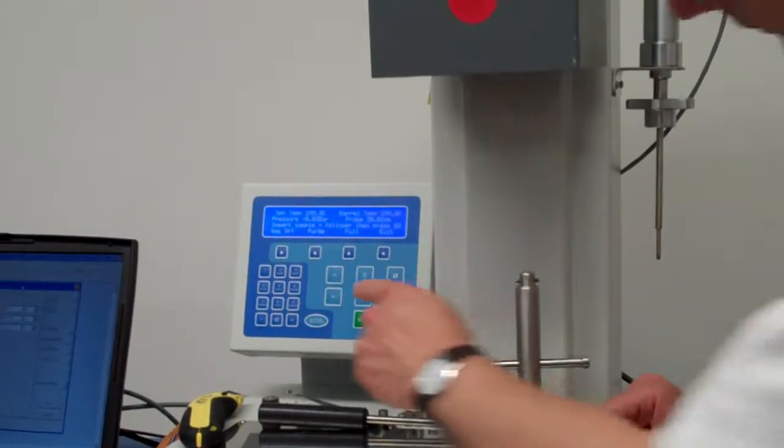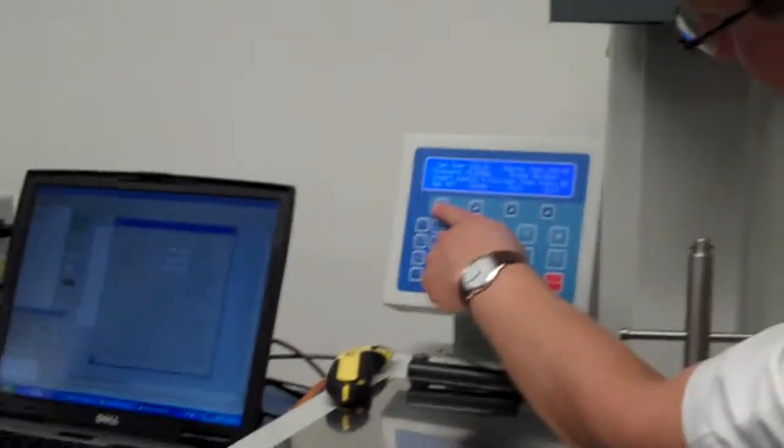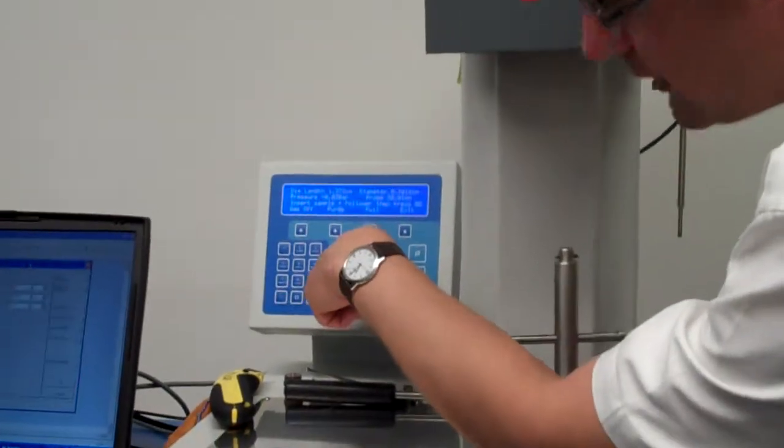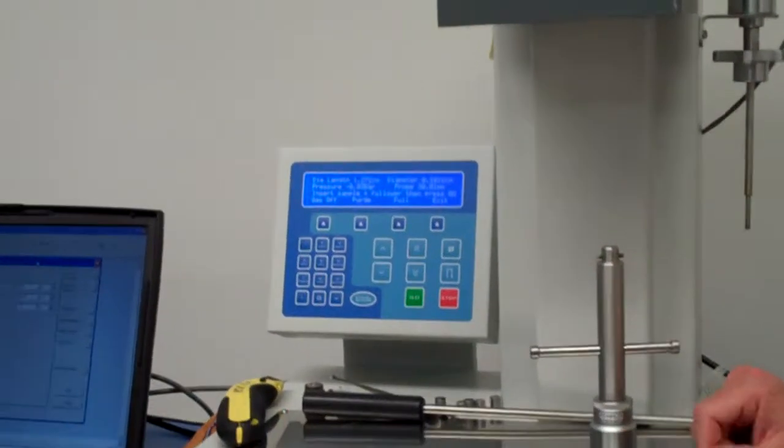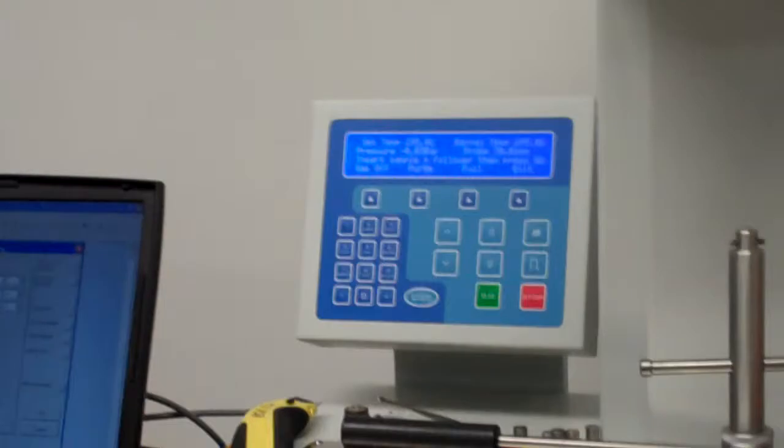We've now got the option on here of gas off, purge, and full. Purge is something that we use and that just allows a very small amount of gas to flow. We'll use purge later. I want to put the full gas on.